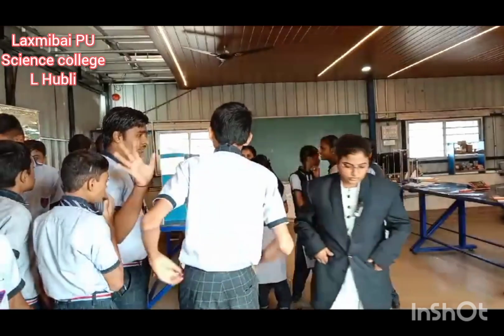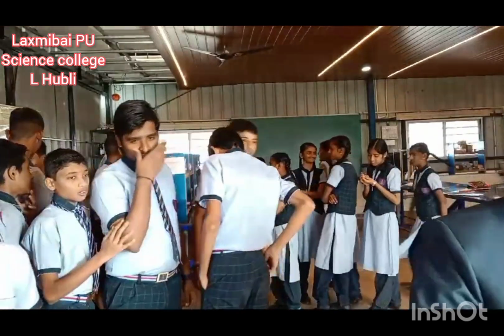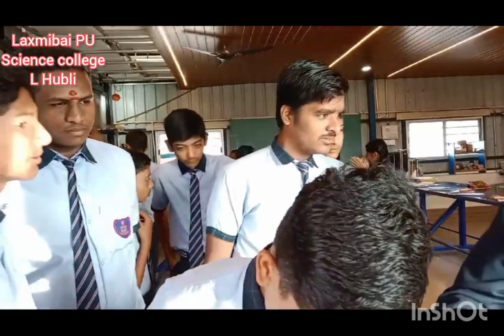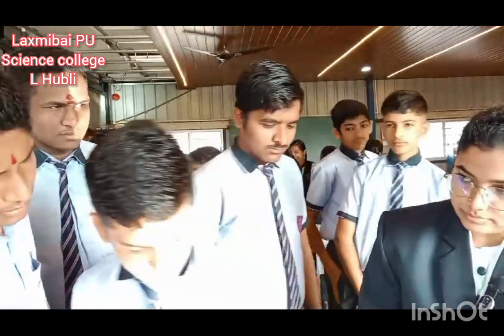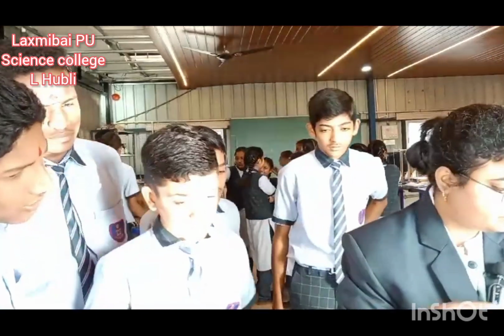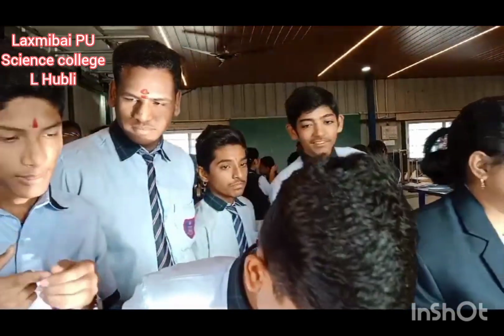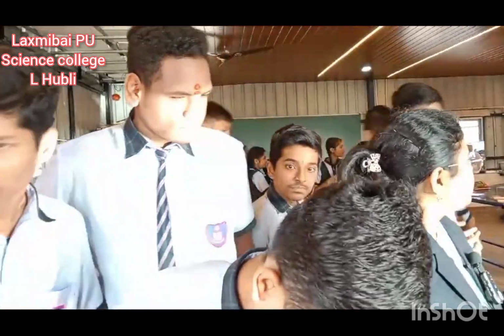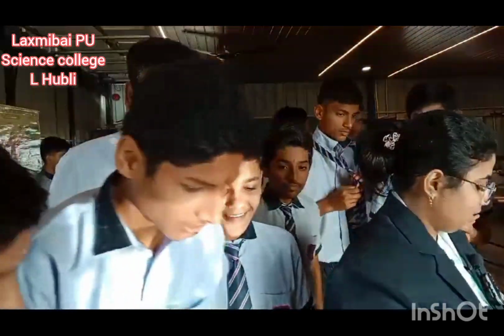Is that material done, or is it ready-made? These are permanent slides. We can say it's a blend, because we can see Hydra and Spirogyra like this. Naturally, you don't find it. When you culture it, only then you will get it, and these are permanent slides which are preserved.